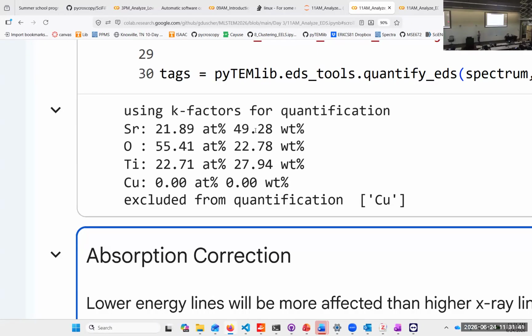We wanted to have a reference spectrum. But it's often that we just leave it a single beam there, right, and the oxygen goes out. That could be one thing. But let's assume we didn't destroy the sample while doing that.